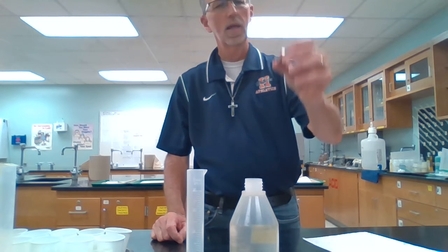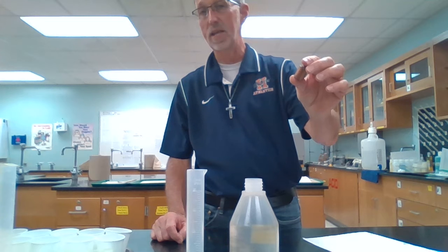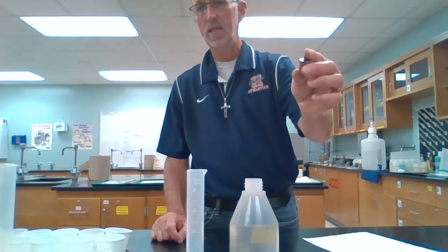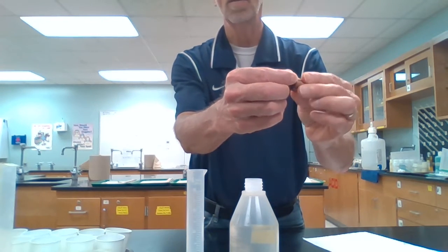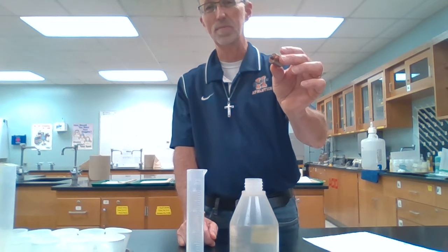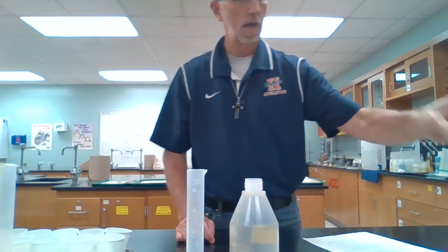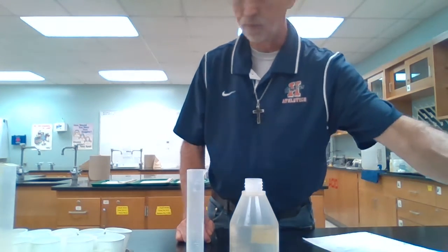Anyway, you're thinking, well, now this is a cylinder, so could we not find the volume of that sample directly? And the answer is no, because if you look at the top there, there's a little handle type piece on there, which would mess that up. So we're going to have to do volume on this one by water displacement too. If it wasn't for that little thing there, we could do it. Anyway, number 3, mass is 54.87 grams, 54.87.